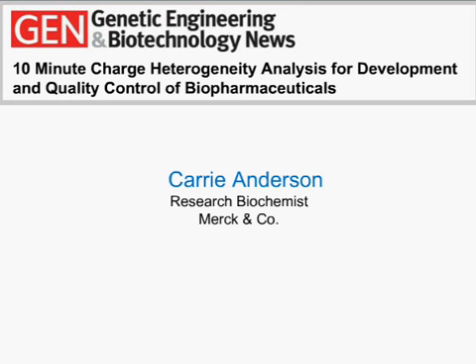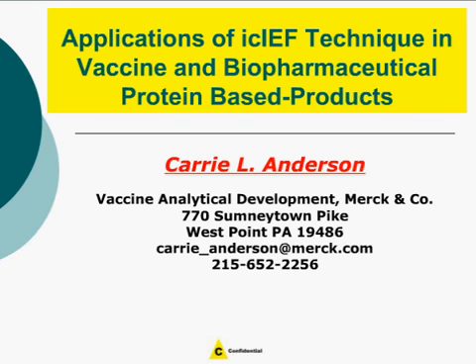Thanks, John. Today I'll be speaking a little bit about some of the applications of imaged capillary isoelectric focusing in vaccine and biopharmaceutical product development.